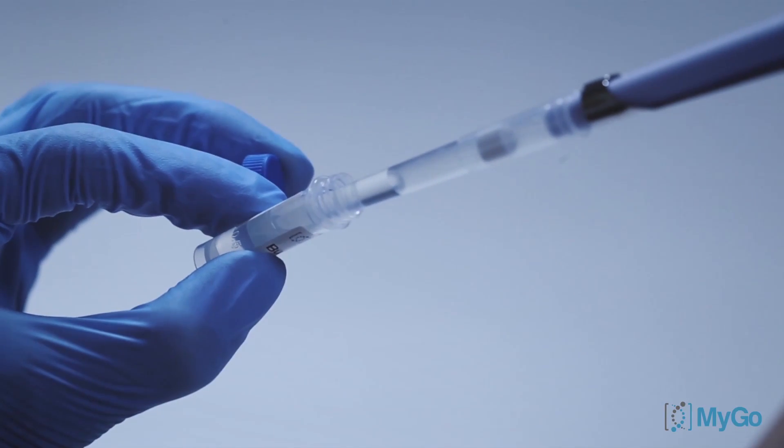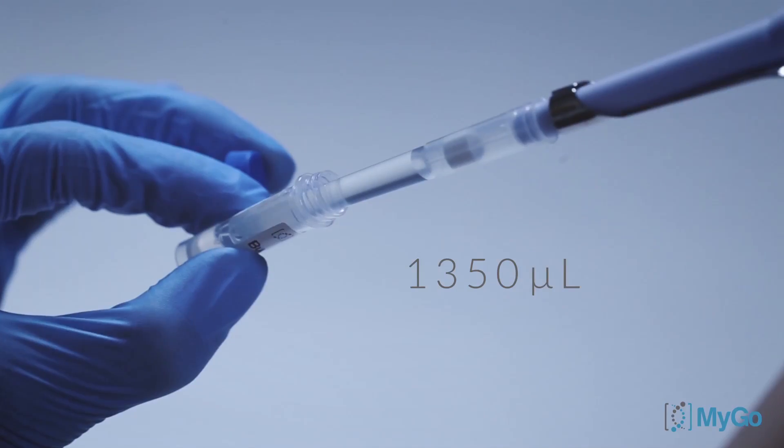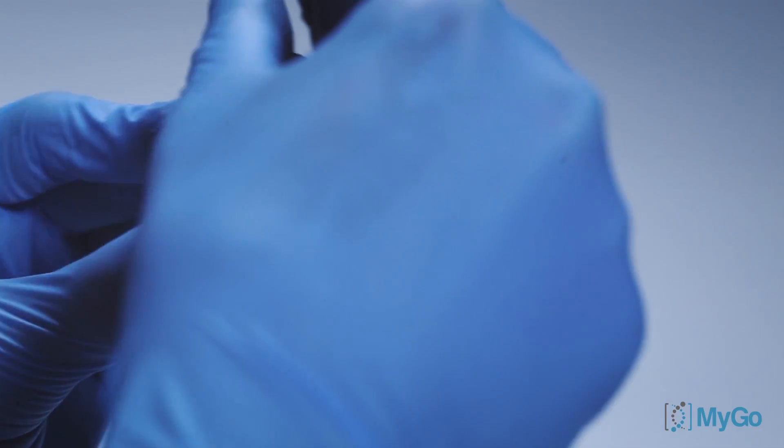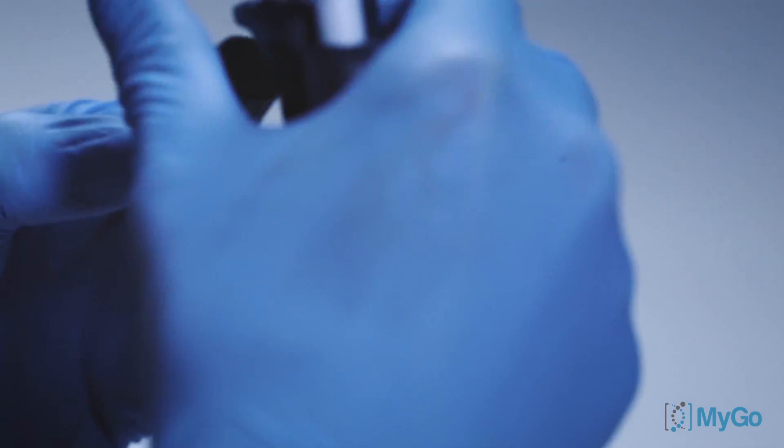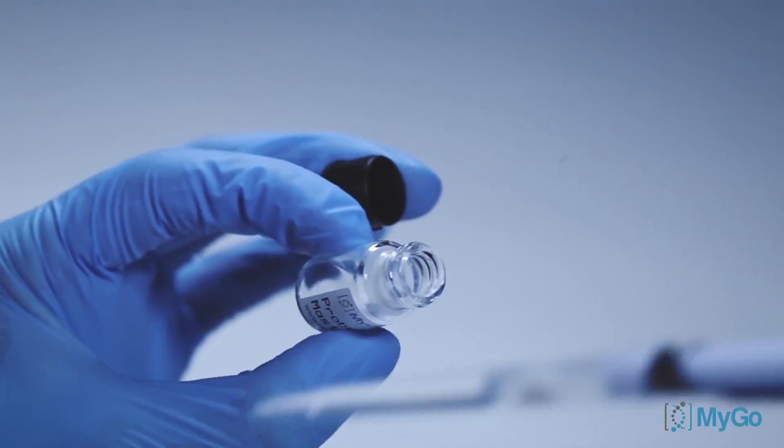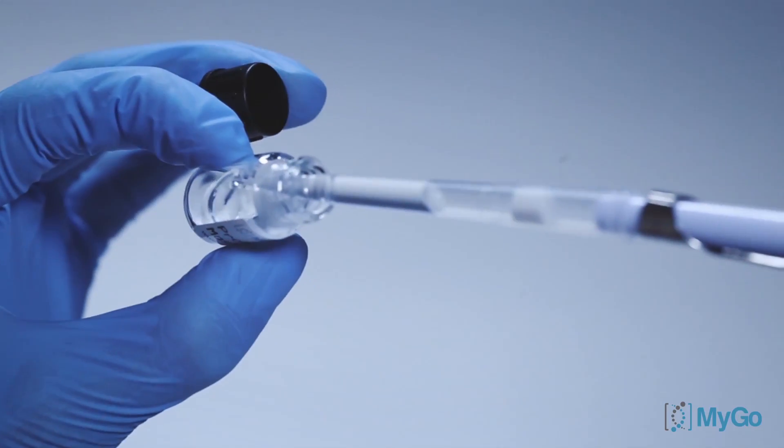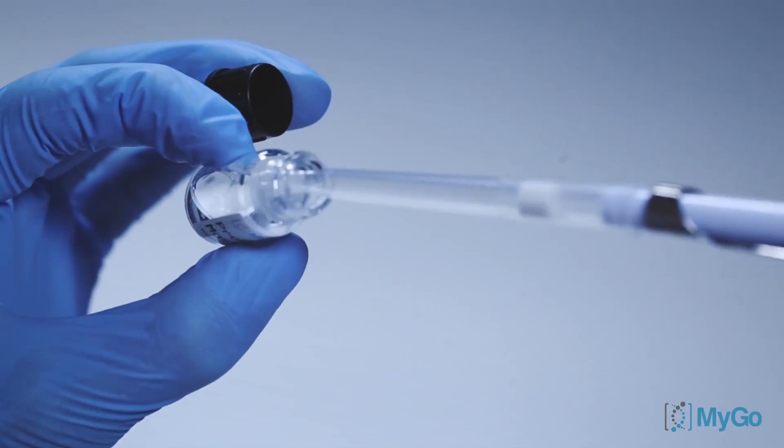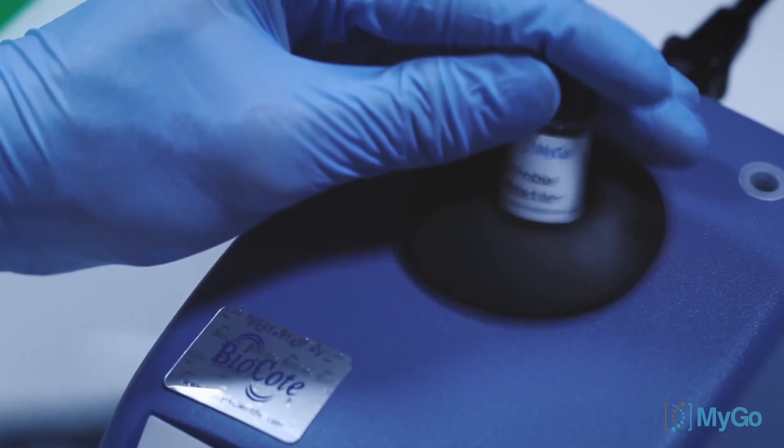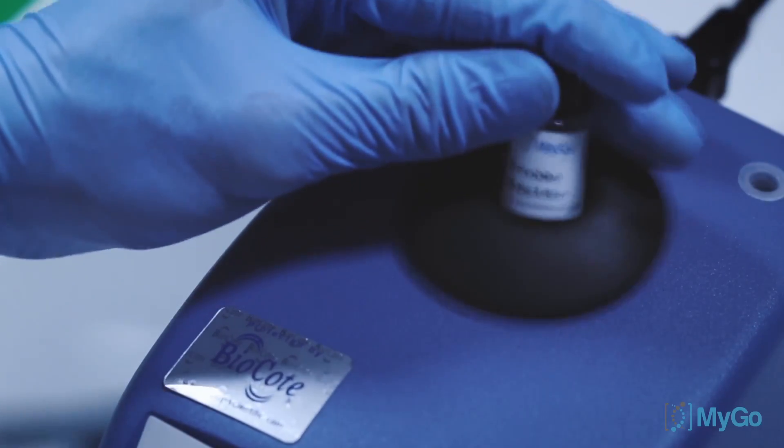First, we need to make up the master mix. Take 1350 microliters or two 675 microliter aliquots of the MYGO buffer and add to the MYGO Probe's master vial. Give the master mix a quick vortex and then leave to settle for one minute.